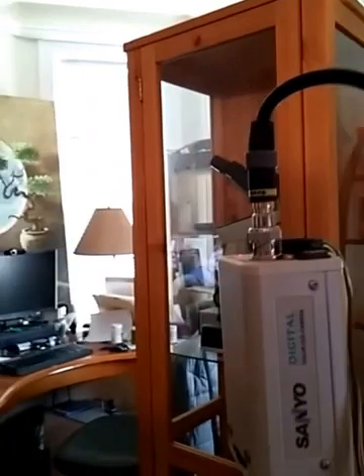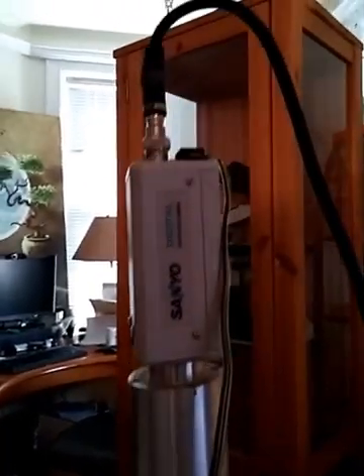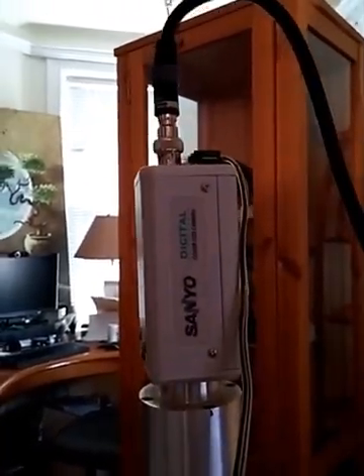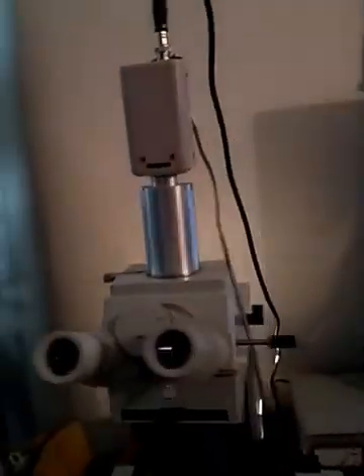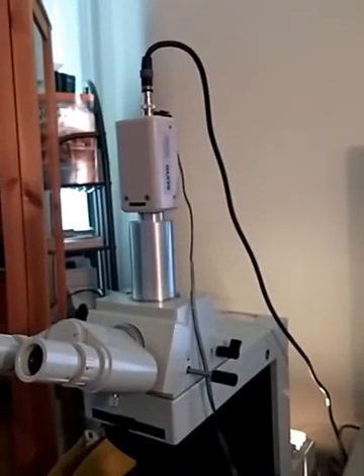It's got a Sanyo video camera, it's one-third CCD. It's old, but it works fine — it makes for good pictures. I would probably upgrade it at some point in the future, put a 5 or 10 megapixel on it. They've come down so much in price; they're just so cheap now, there's no reason to not have the best.